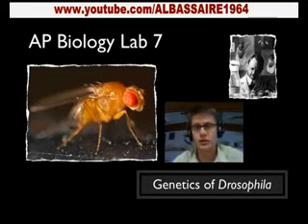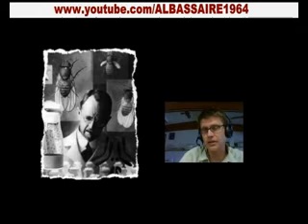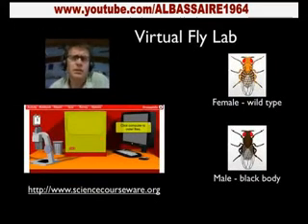And so where did the fruit fly lab all begin? It's with this guy, Thomas Hunt Morgan, and he's in his fly lab right here working on this fruit fly. Fruit fly is great because it has a pretty simple genome, reproduces very quickly, and it's easy to keep in the lab. So in this lab, let me walk you through the way we use sciencecourseware.org. They've put together this virtual fly lab, and you can really crank through a bunch of fly crosses really quickly. And the statistics are pretty good.